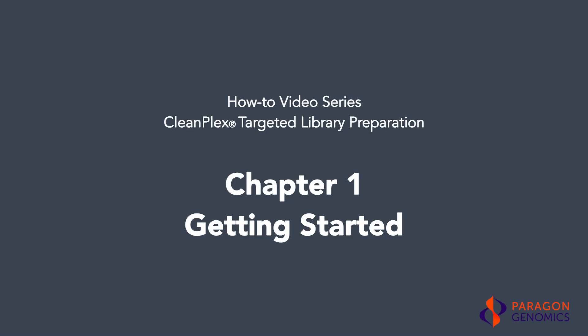Before we begin the CleanPlex targeted library preparation protocol, it's important to have all the instruments, supplies, and reagents ready to ensure successful completion of the protocol. In this video, we will show you how to get ready to construct your CleanPlex libraries.